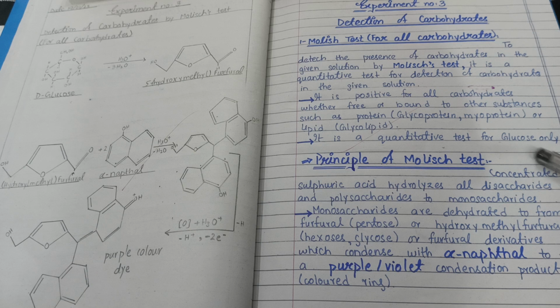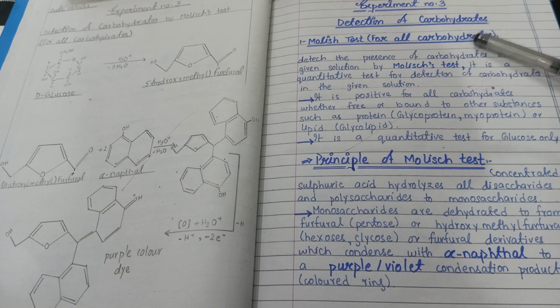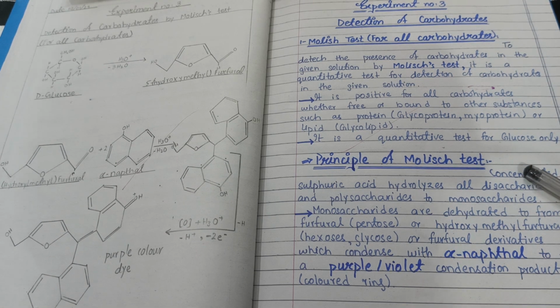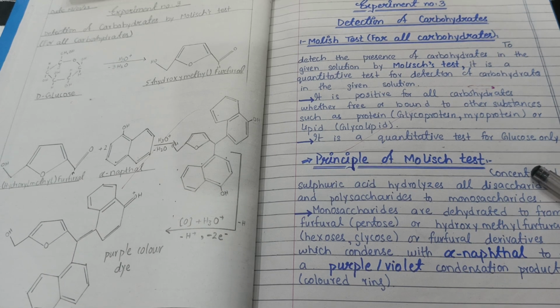First of all, the first test for the detection of carbohydrate is the Molisch test. The Molisch test is for all the carbohydrates. We will discuss some other tests for the detection of carbohydrates. We have 7 tests in total for the detection of carbohydrate, and the Molisch test is the one which can detect all carbohydrates.